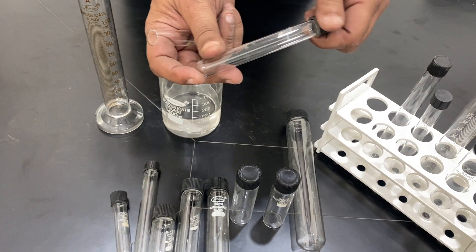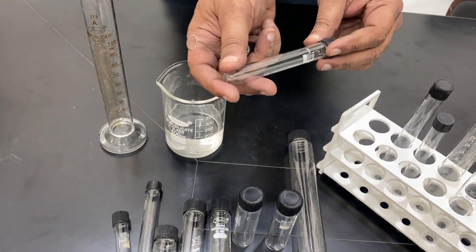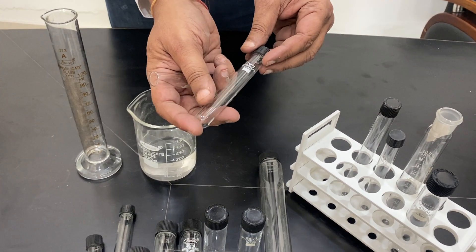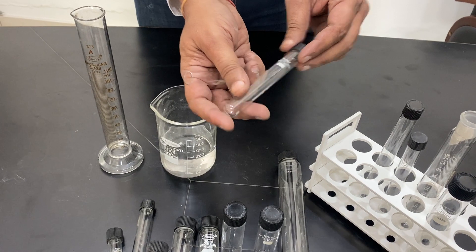Another kind is the round bottom. This one is a round bottom — they are sometimes called culture tubes with a round bottom. We have our catalog on the website for round bottom culture tubes.